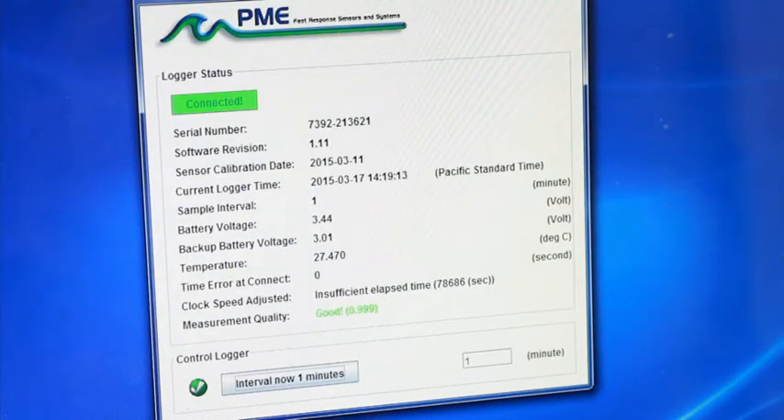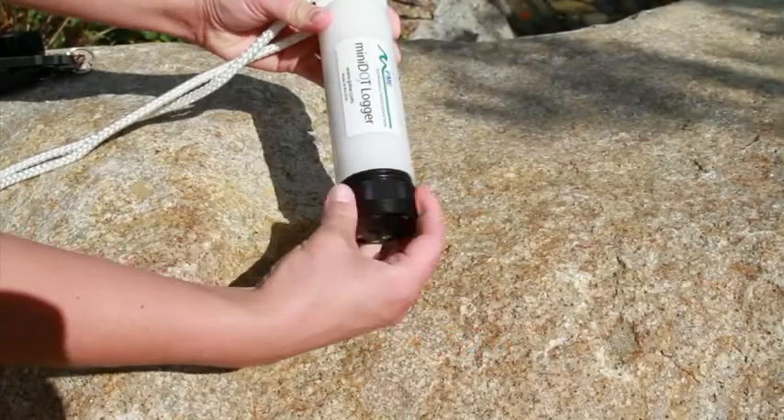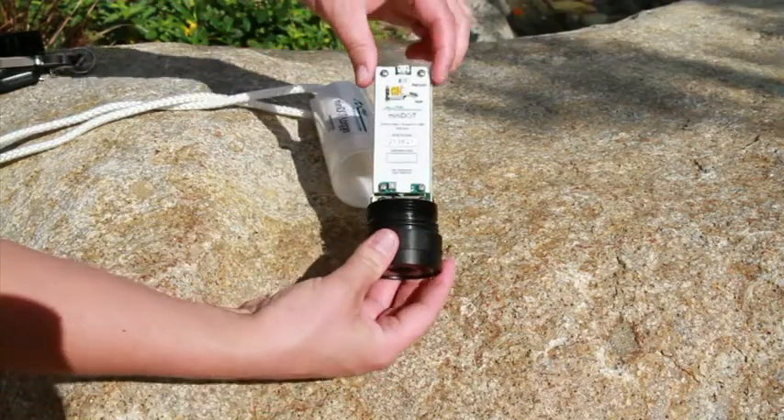When you are done, close the control program and remove the logger from your computer. To begin recording, open the mini dot logger and move the internal switch to record. The LED light will flash green five times.